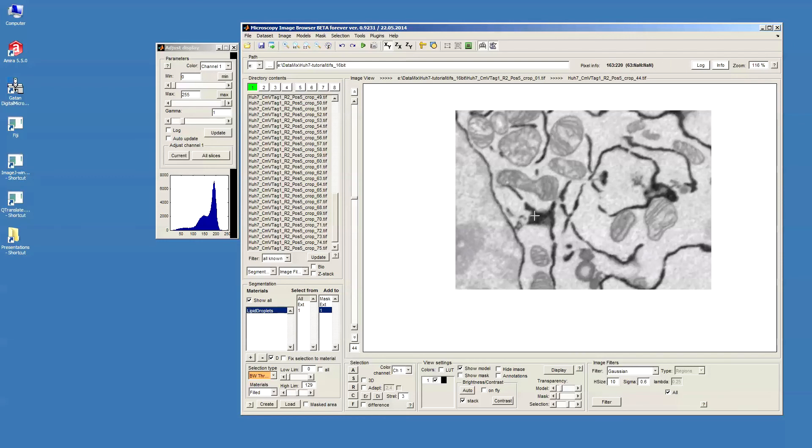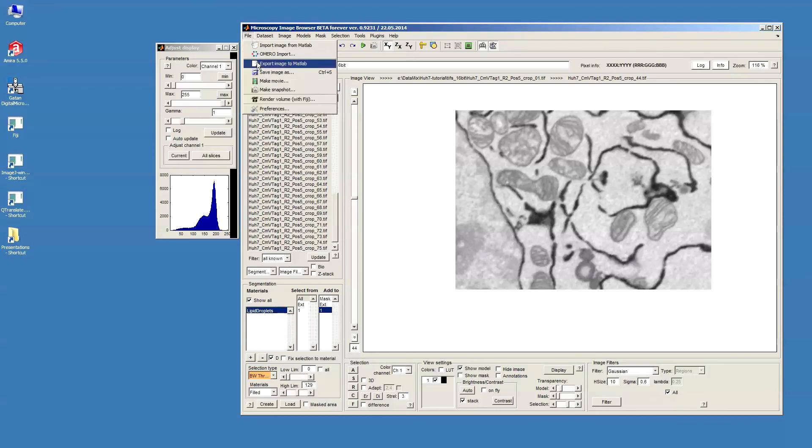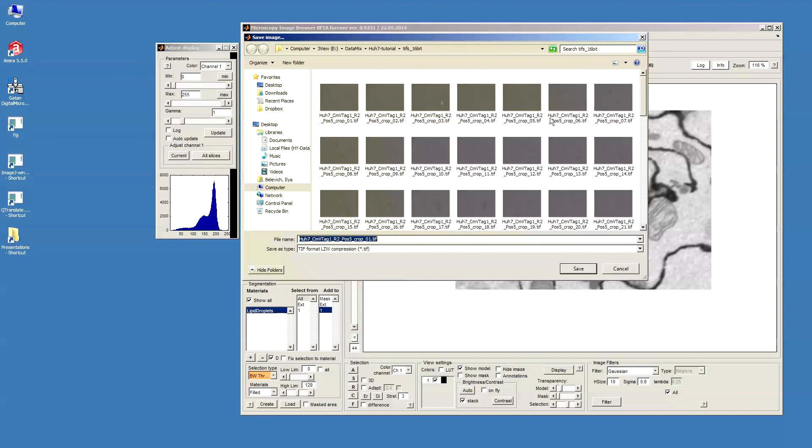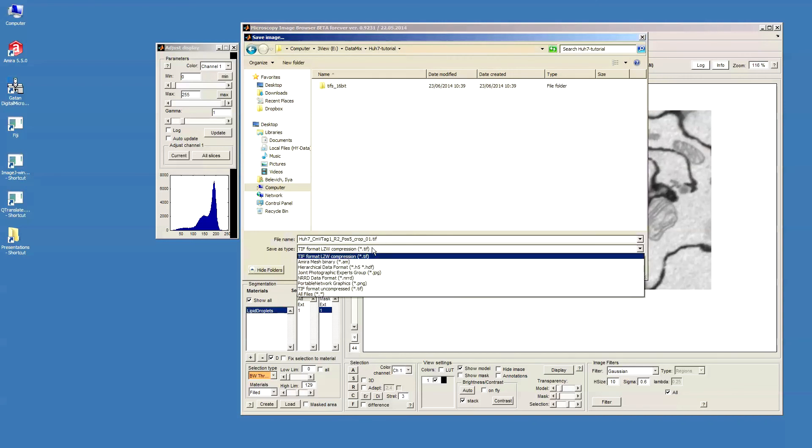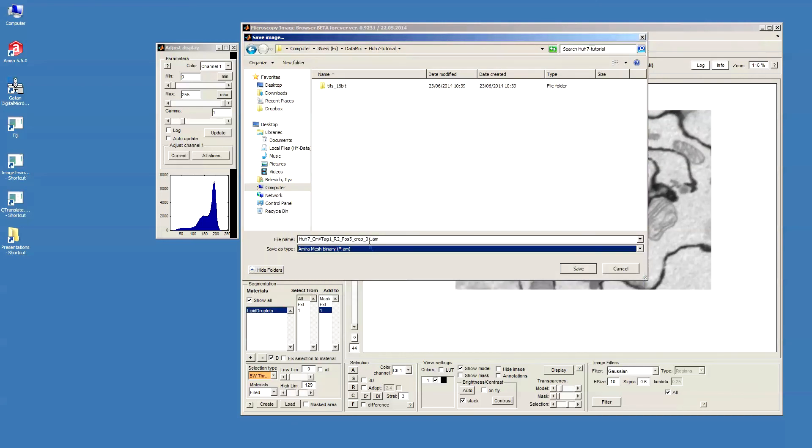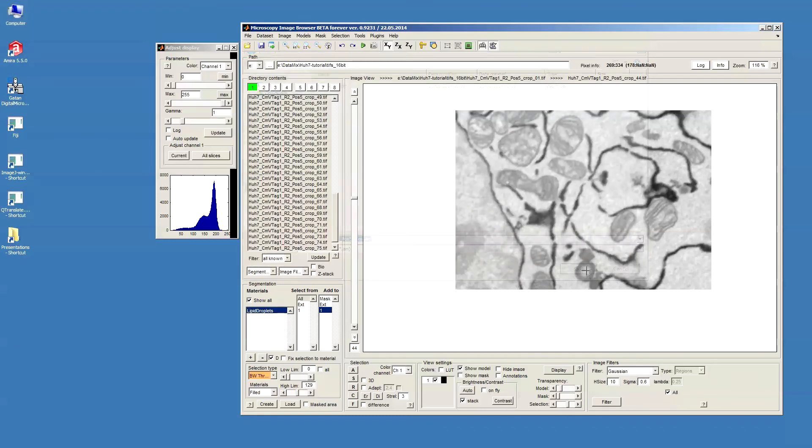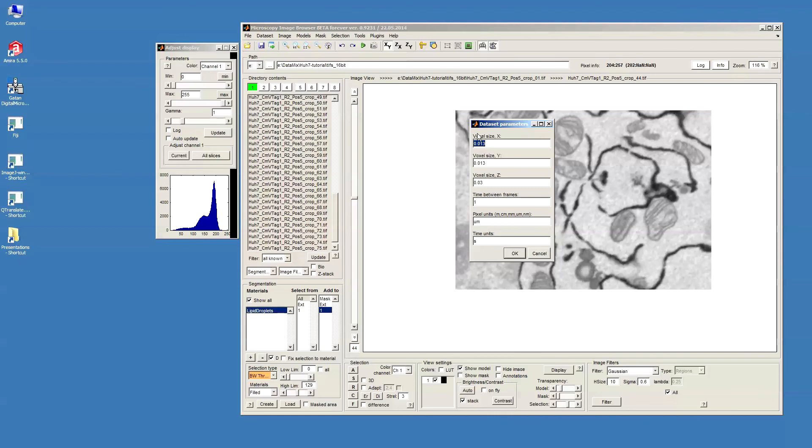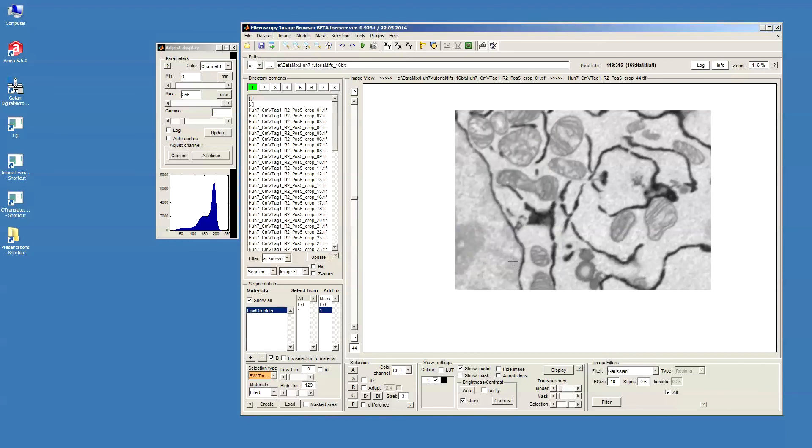Before we continue further I would actually save the dataset to disk because we processed it a little bit and it will be much faster the next time we open the data that's already at this state. So, go to File, Save Image As. Now we start in the same folder where we used to open the data, so we just go one directory up and I will use a MIB mesh file for storing the data. When it saves it asks again for these parameters as voxel size but we are fine with those. Now we can save it and then we continue with lipid droplets.